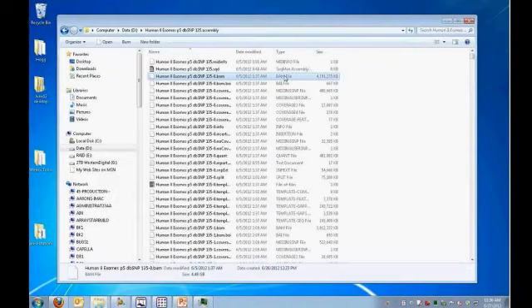So if you need to bring this BAM file to another point in your pipeline for analysis, you are able to do that. And you could bring this to a BAM file viewer and look at the BAM file. The other files that we've created are things like SNPs. We call them missing SNPs, but SNPs that are absent from some of the samples, coverage information. We have feature information, gaps in the template.